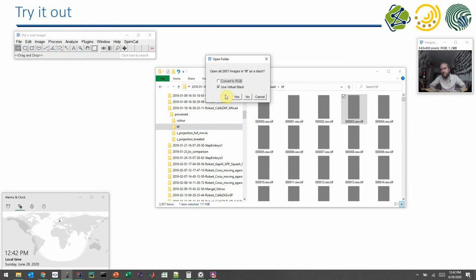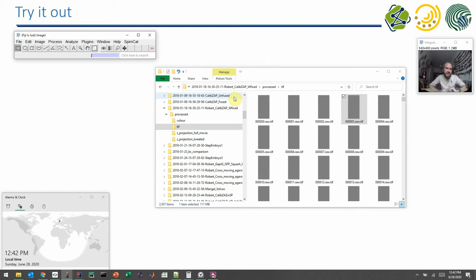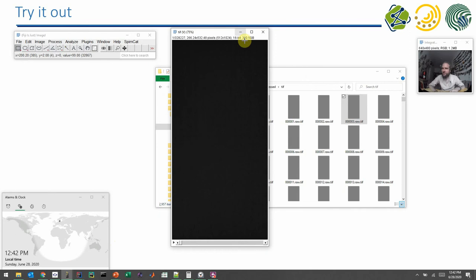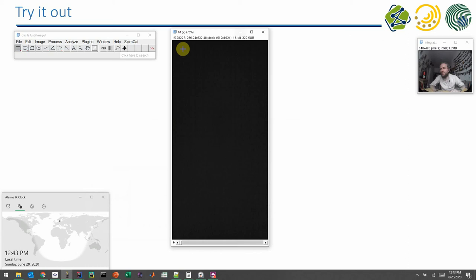It asks me if I want to open it as virtual stack. This checkbox is usually turned off by default. I will click on yes. It is actually going through all the files, but it is not loading them. It's just looking if these files have the right size. I will speed up this video so you can watch the clock. So it did load my 2950 files, which are 320 gigabytes large, in less than a minute.